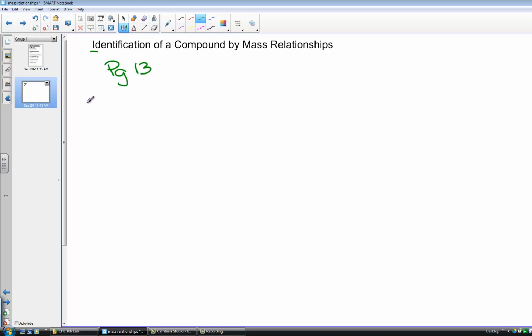On this page is the identity of 4 possible salts, one of which we will be given. The first is sodium hydrogen carbonate, NaHCO3. Sodium hydrogen carbonate is sometimes called sodium bicarbonate. It is actually baking soda. The second sodium compound we're given a choice of is sodium carbonate, Na2CO3.